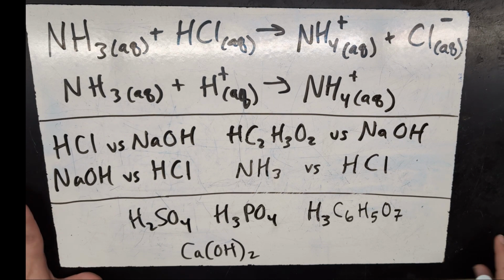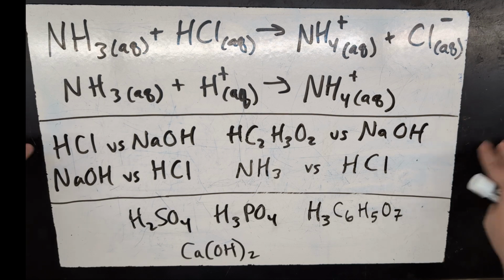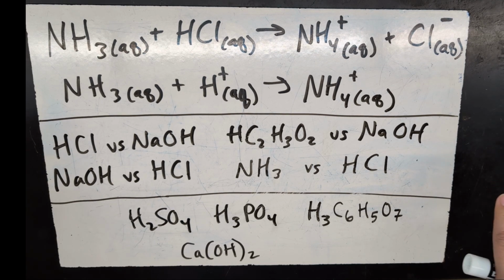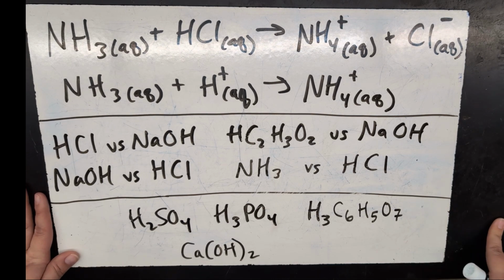This goes along really well if you are also doing some kind of particulate diagram representation throughout the titration itself. So I sometimes will have each group then create a large version of the titration curve that they created from their data and label the particles that are present at each of the major points during the titration, and that way when the groups visit, they can see, oh, okay, these are the important bits that they need for that particular type of titration.